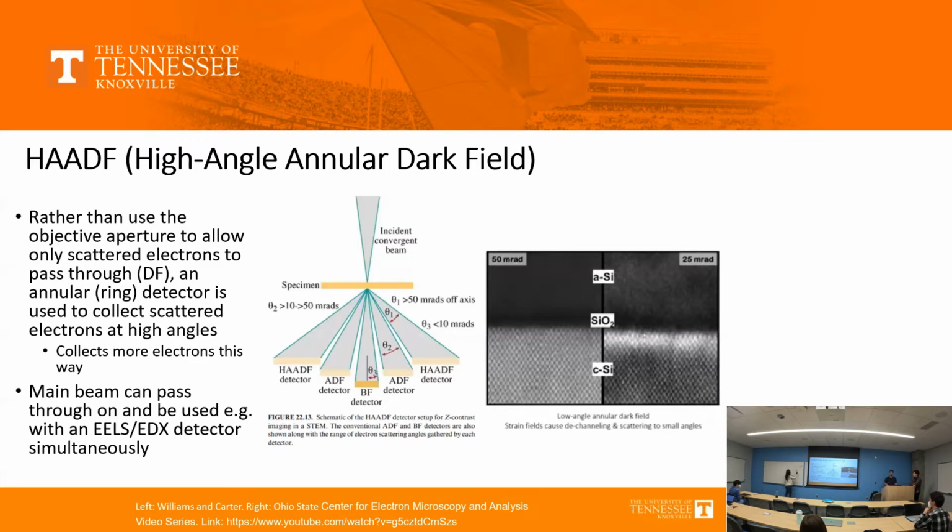As you have more charge, you scatter more strongly, which means that high angle annular dark field gives a very good Z contrast, enabling you to distinguish between unlike elements pretty well. For this reason, because you get this very precise distinction between different elements, this is often used for the size and distribution measuring of precipitates, because you can distinguish between the precipitate and the matrix most easily.